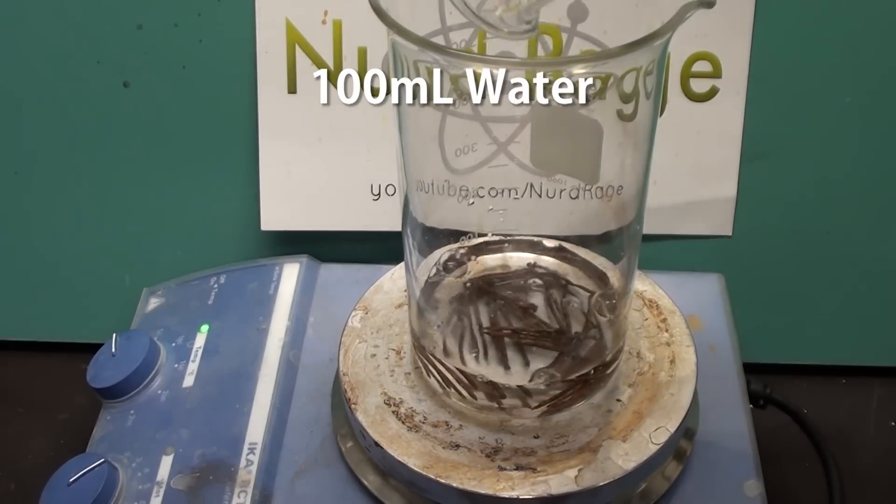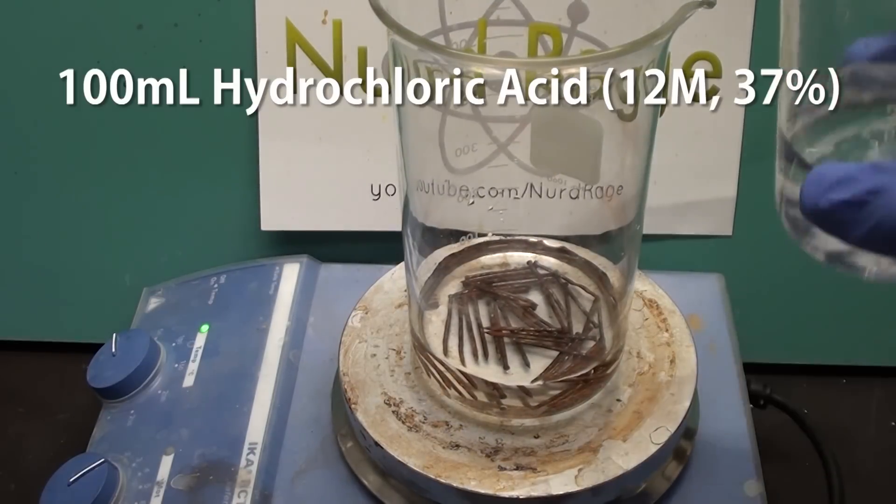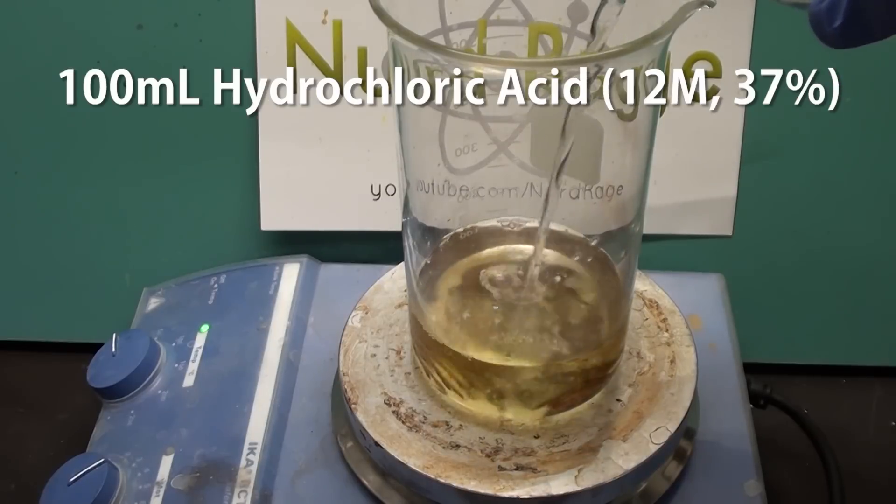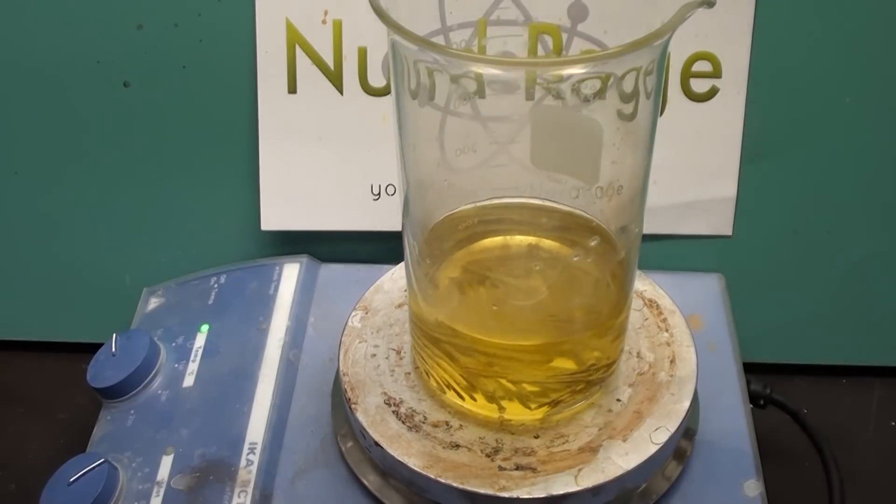Now add to it 100mL of water and then add 100mL of concentrated 12 molar hydrochloric acid. The acid should start dissolving the iron.